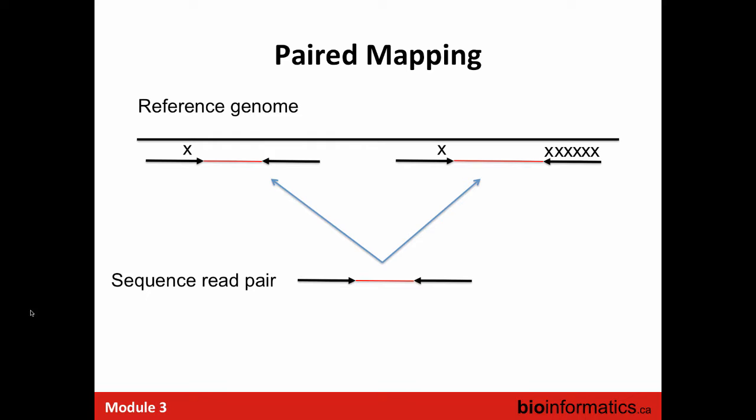It gets rid of just the statistical variability caused by these phasing problems, overlap between the fluorescent spectra for the nucleotide tags. What it doesn't get rid of is amplification artifacts. If you've amplified your DNA and the amplification made an error, that's going to be read the same way twice, and it won't fix that. The amplification for the cluster or the PCR that you do beforehand? Mainly the PCR that you do beforehand.